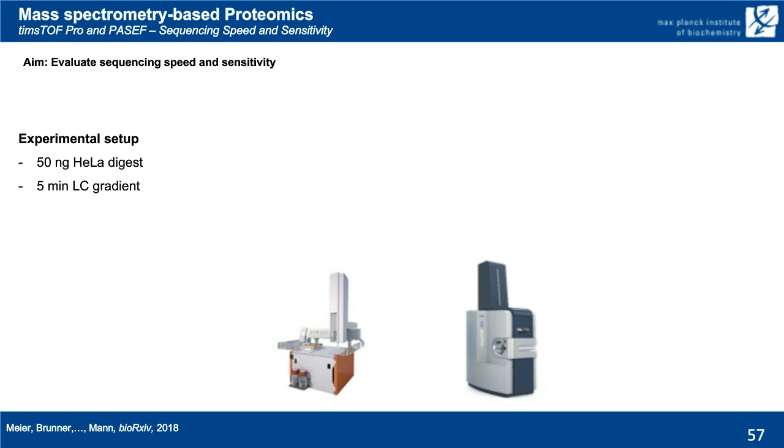The main issue is that when you perform measurements on other LC systems and decrease the gradient time, in the end your mass spectrometer is sitting around longer than it's actually measuring, because the overhead time is too large for these LCs.